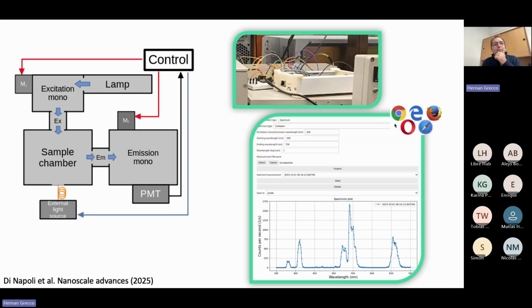So what we did is we rebuilt the electronics. This is our demo with open source electronics, and we created an open source software that runs on a Jupyter notebook that is able to do the same measurements that we were doing before, but now with a software and a hardware that we can maintain and keep using, and we don't depend on a very old computer and a very old file format.